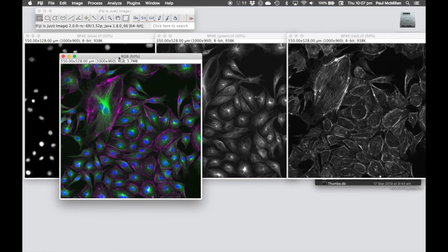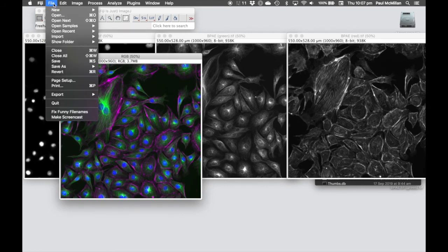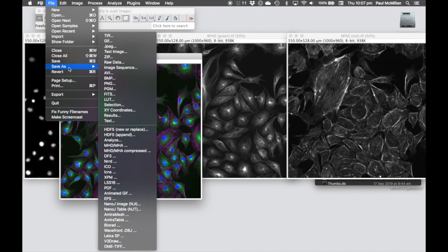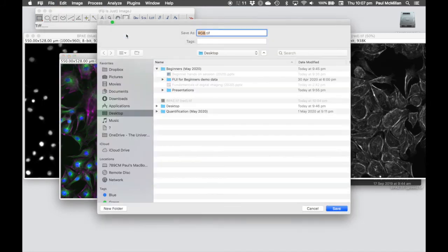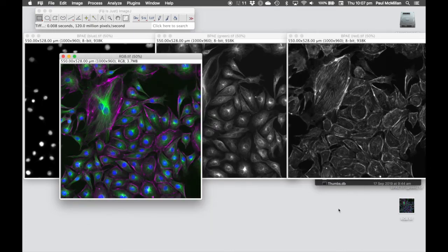It's already an RGB file, so we don't need to infer that. We can just go Save As TIFF, rename it to whatever you want, and save that onto the desktop.